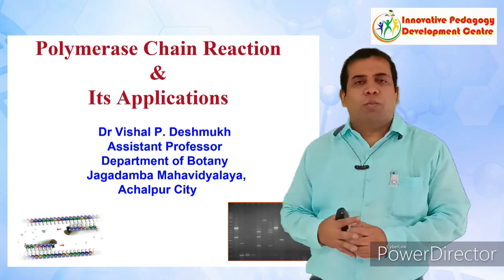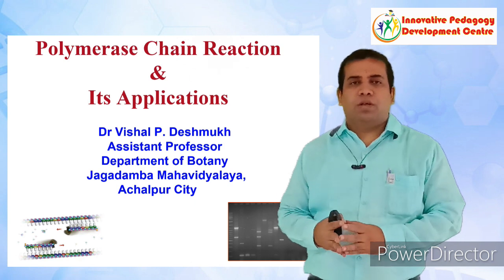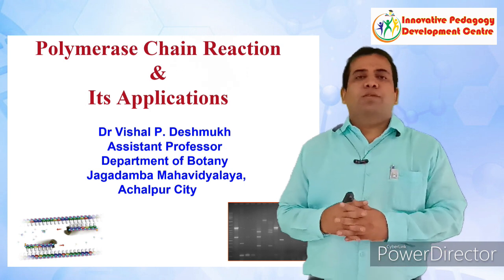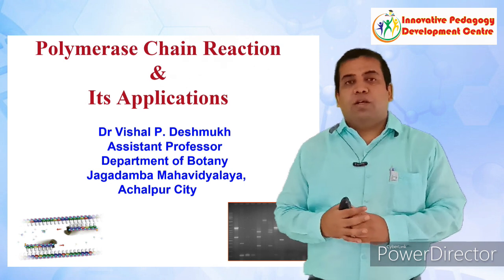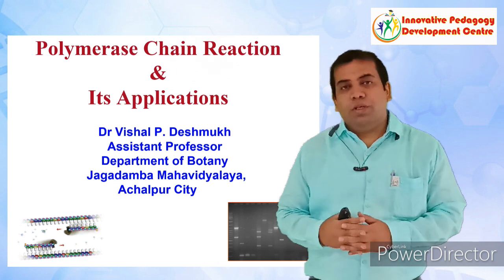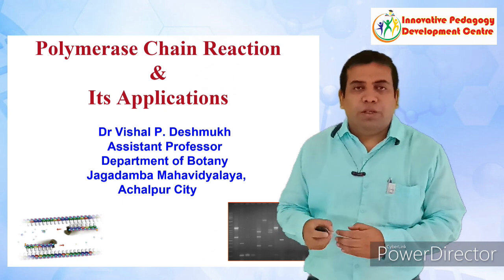Our second topic of discussion is polymerase chain reaction and its application. In the present scenario, when corona is making havoc, you might know that this polymerase chain reaction machine, or PCR, is the only device available to detect it. So this is a very important machine for any era of molecular biology.